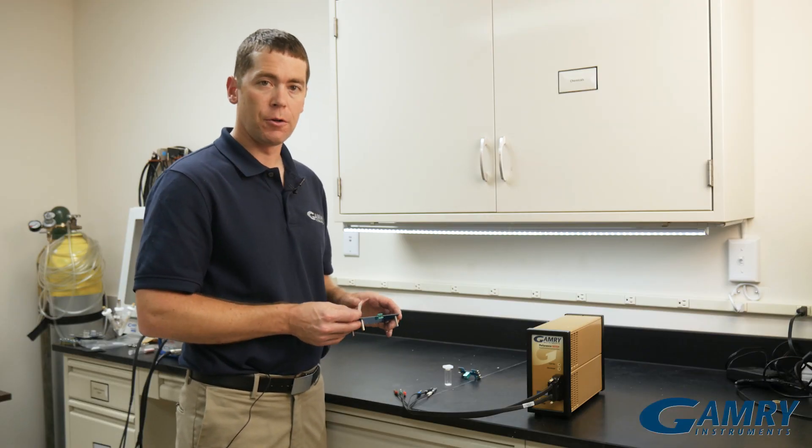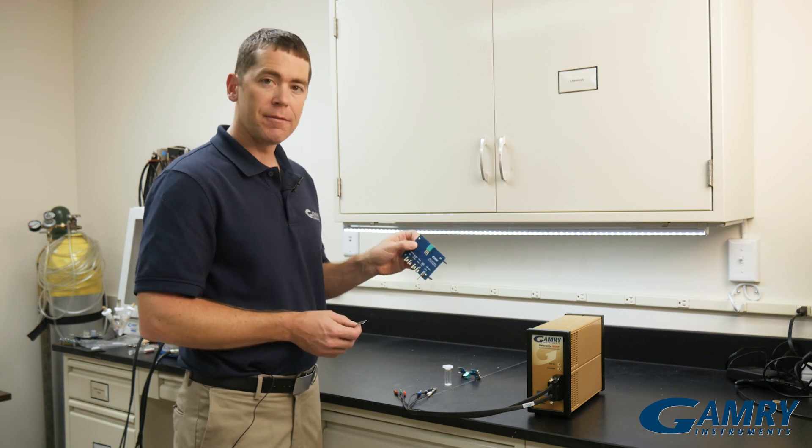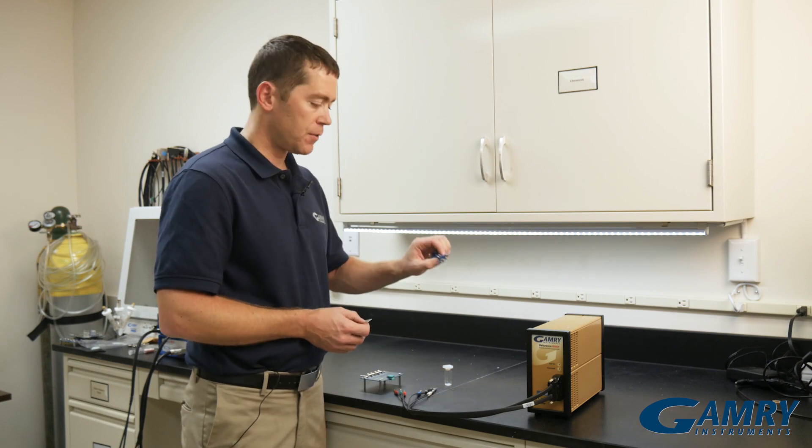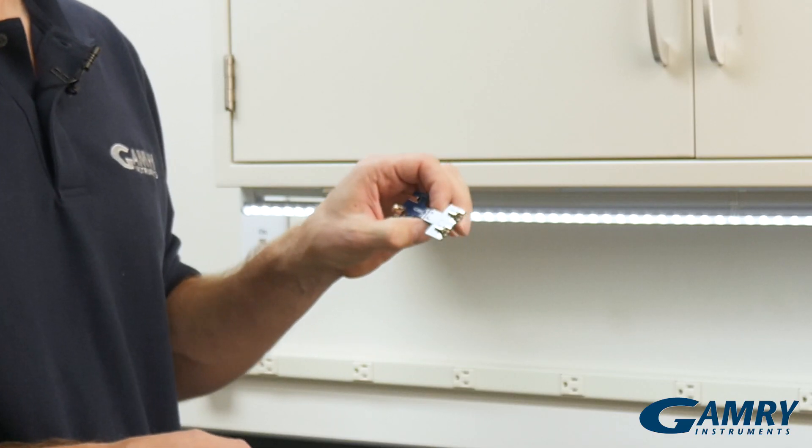We have two different screen printed electrode holders. One is this simple little screen printed electrode holder stand, and the second one is a screen printed electrode holder for a cuvette.